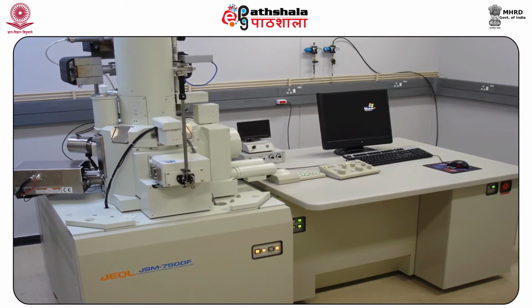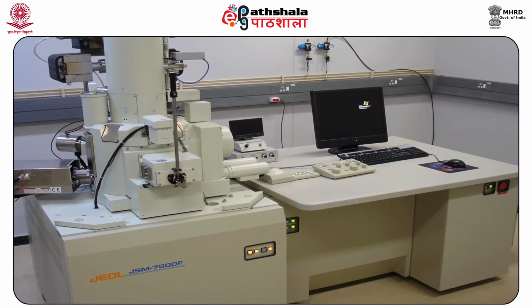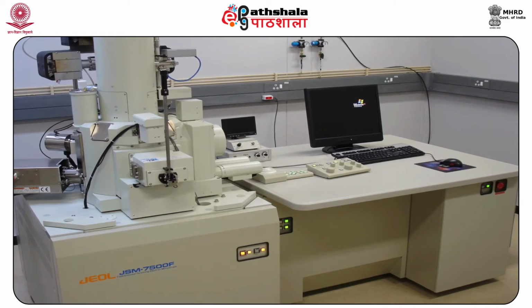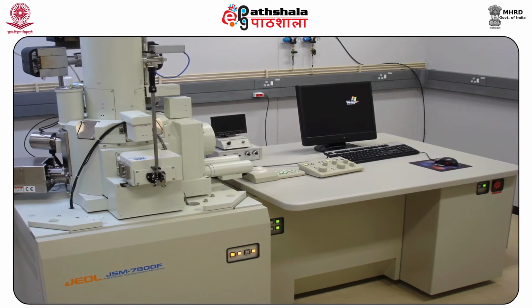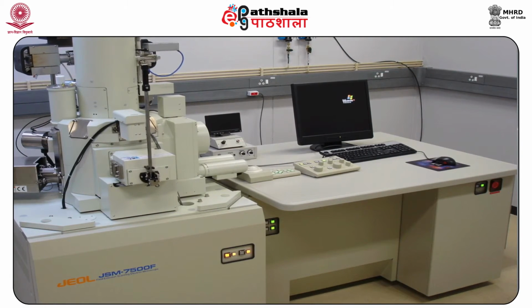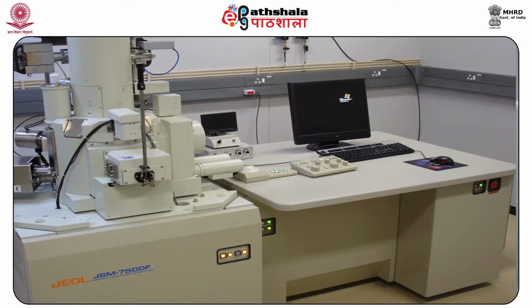In this chapter, we have learned that a beam of electrons visualizes the object under observation rather than visible light as in a conventional optical microscope, as the beam of electrons is focused by a series of magnets rather than glass lenses.